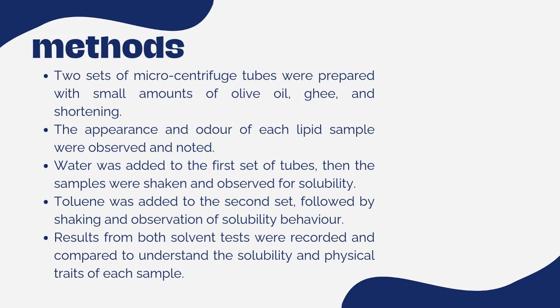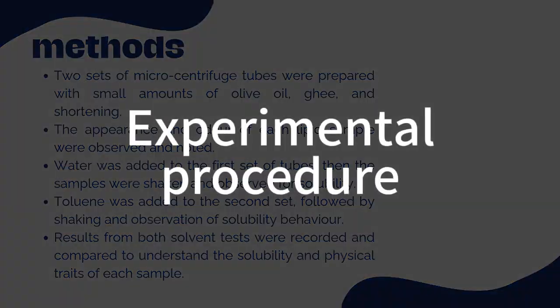For the second set, toluene was added to examine solubility in non-polar solvent. Again, the samples were shaken and observed. All results were recorded in a table for analysis and comparison.